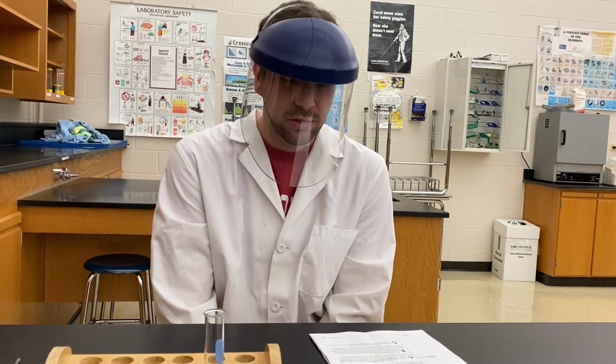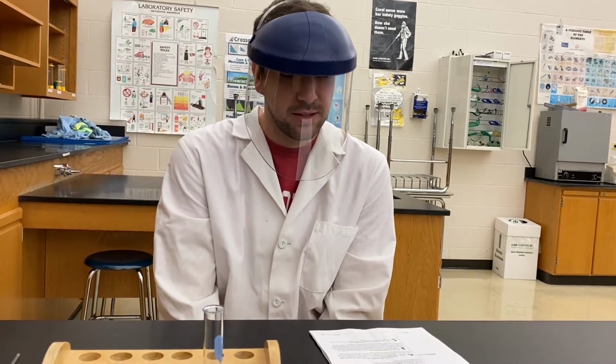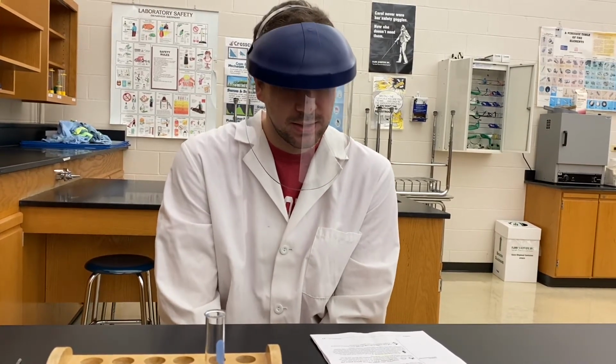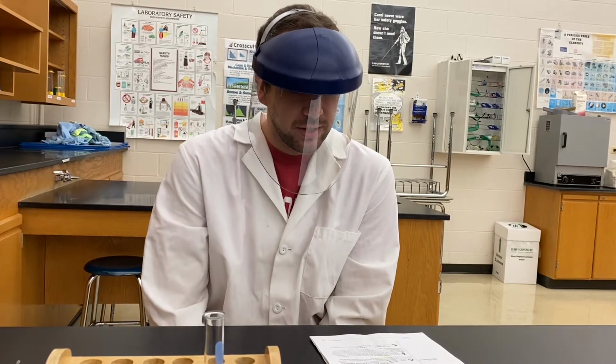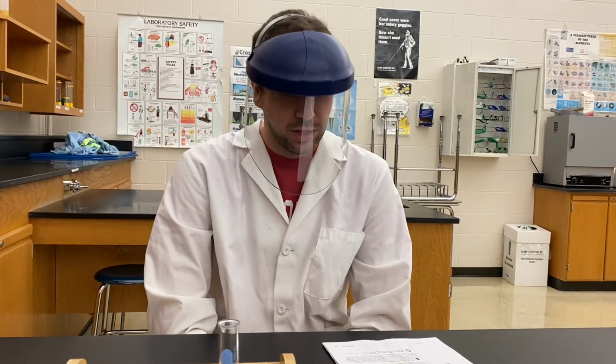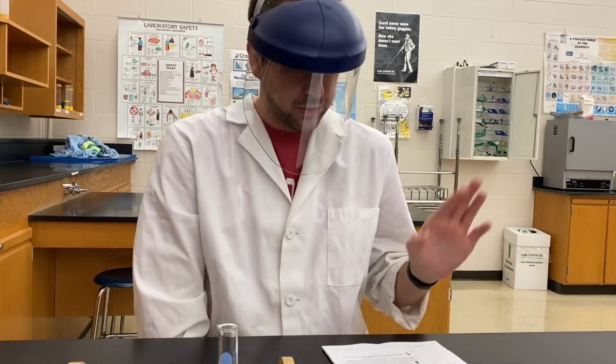In this experiment, you will observe a sequence of changes that occur when a solution that begins as copper 2 nitrate is treated with a series of different reactants. All of the reactions will take place in the same test tube, right here. At each step, you will look for evidence that a new substance is formed as a result of a chemical change. You will also observe heat changes and relate them to chemical reactions.